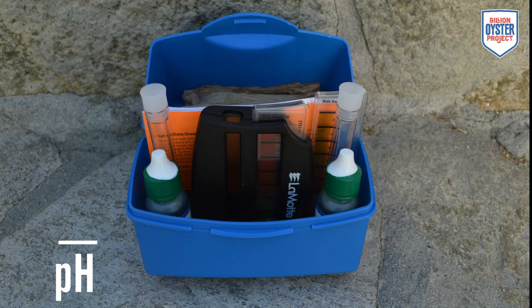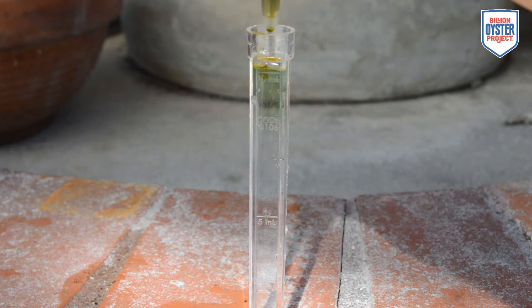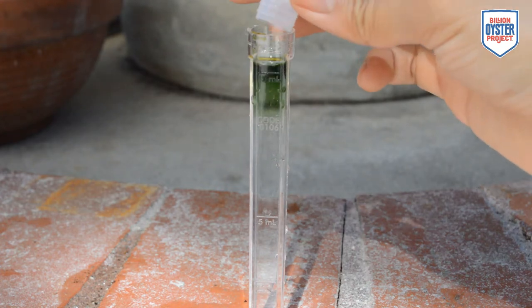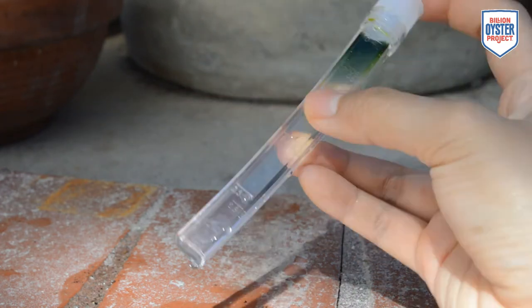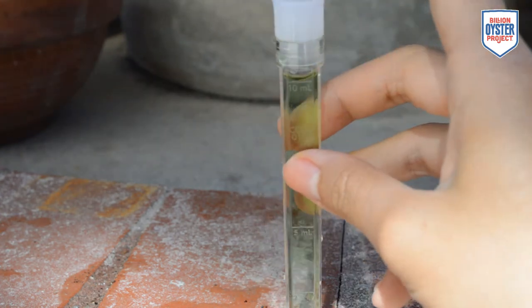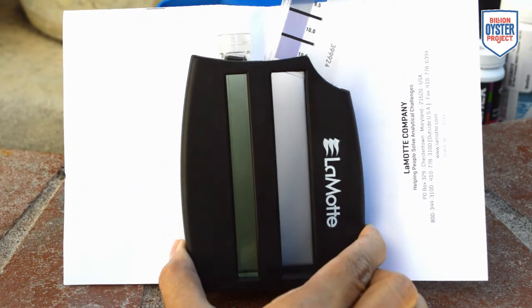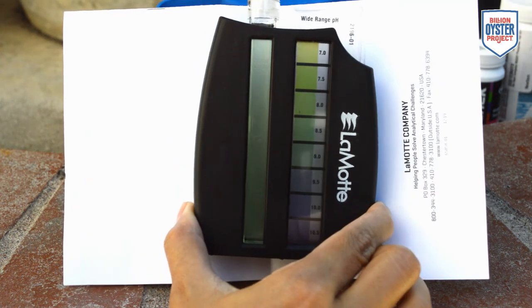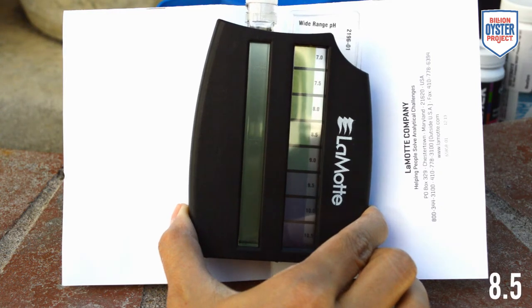To measure pH, we will be using LaMotte's Precision pH Kit. Fill the square test tube to the top line with sample water. Add 10 drops of the wide-range indicator solution. Cap the test tube and invert until the indicator solution and sample water are thoroughly mixed. Insert the test tube into the comparative viewer and insert one of the color standard cards into the right-hand slot. I like to place a piece of white paper behind the comparative viewer to help make the best comparison. Record your result, and remember that pH does not have any units.